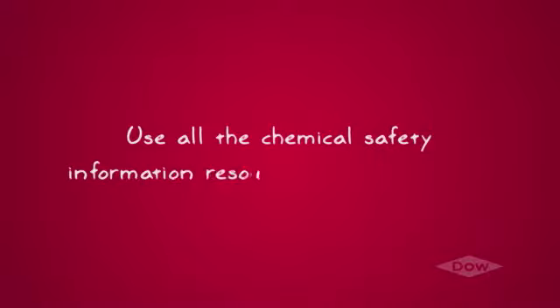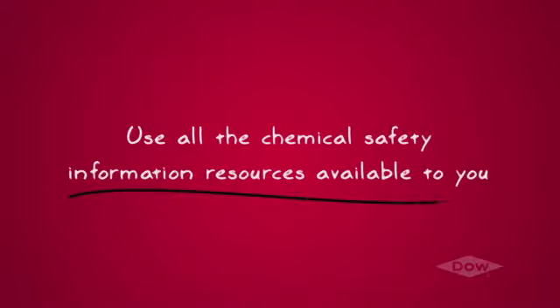Remember, there are numerous online and library resources that contain chemical safety information. Your local environmental, health, and safety, or EH&S experts can help you locate these resources. Be sure to use them as you complete your SOCs.